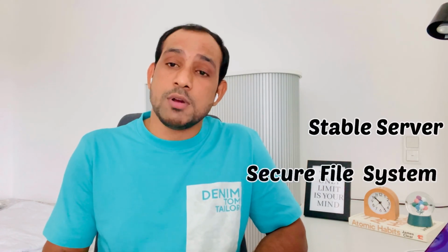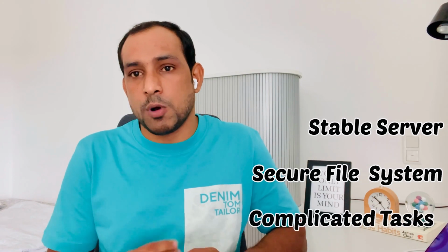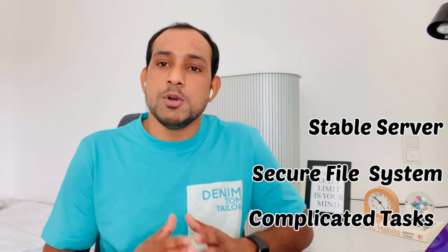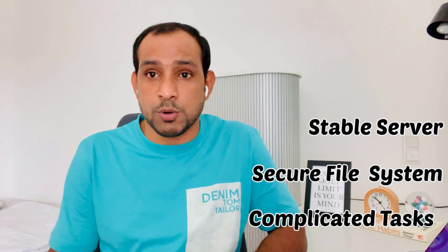In this video, I'm going to talk about the command line terminal. Why do we need this and what are the useful commands if you want to play with the RNA sequencing data? In short, I would like to tell you that Unix operating system offers stable server, it has a secure file permission system, and it can perform complicated tasks. So this is why we use Unix or Linux operating system, not the Windows.